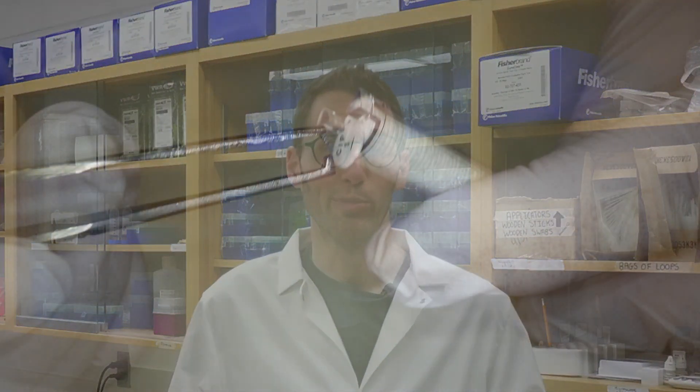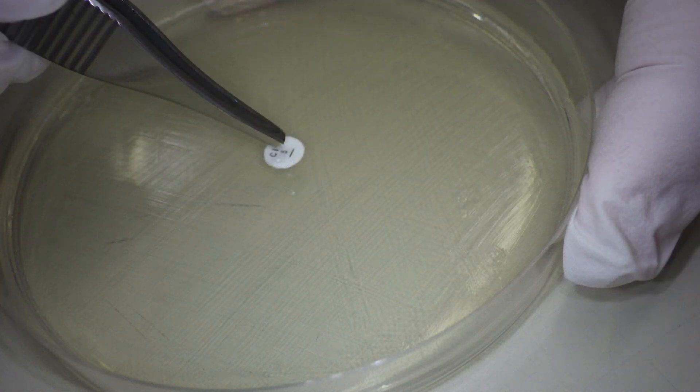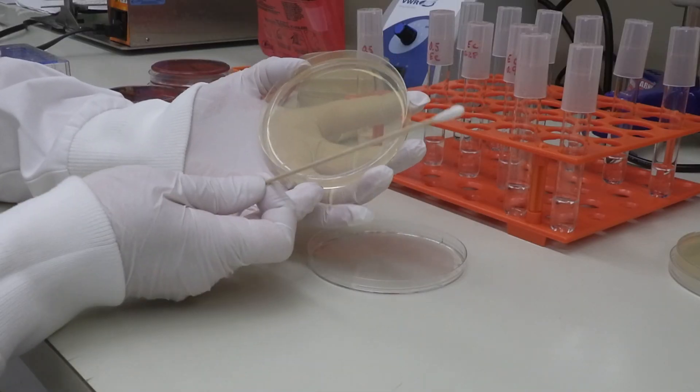The disc diffusion test is a simple assay for determining the antimicrobial susceptibility of a bacteria. I've previously put together a video showing the process of performing this test, but in today's video what I want to show you is what happens when the test is done incorrectly to really highlight the importance of standardization.